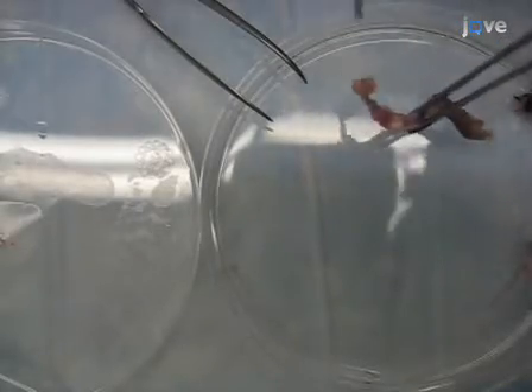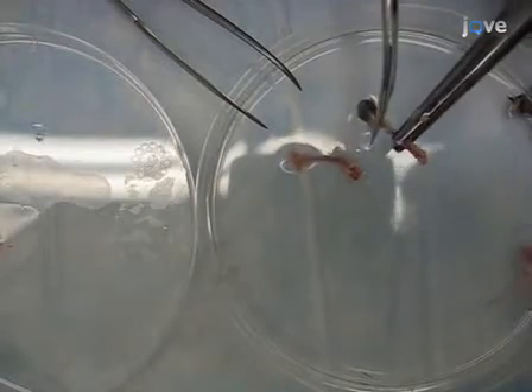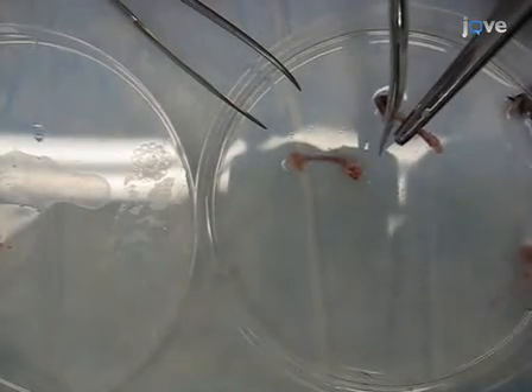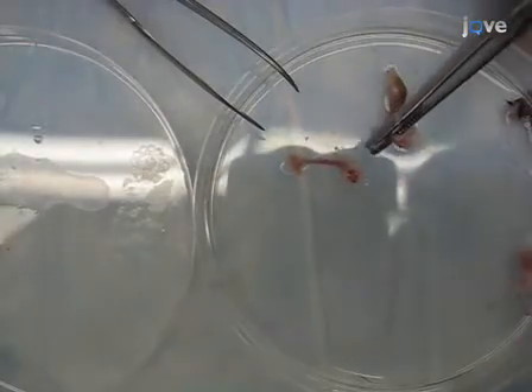If many dendritic cells are required, the second leg may also be harvested. To remove the bone marrow, ensure that there is no muscle tissue remaining at the extremities of the bone. Then using the bone scissors, separate the bones of the knee joint, then cut off the epiphysis of the first bone.